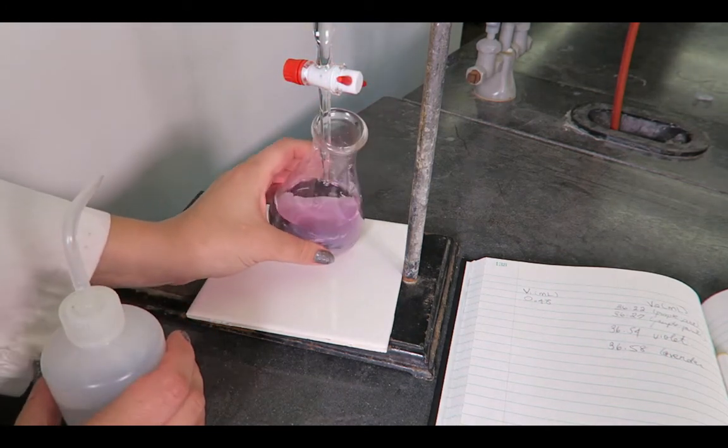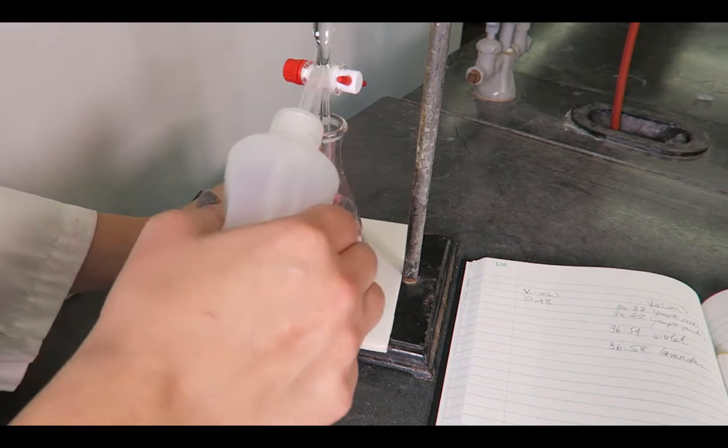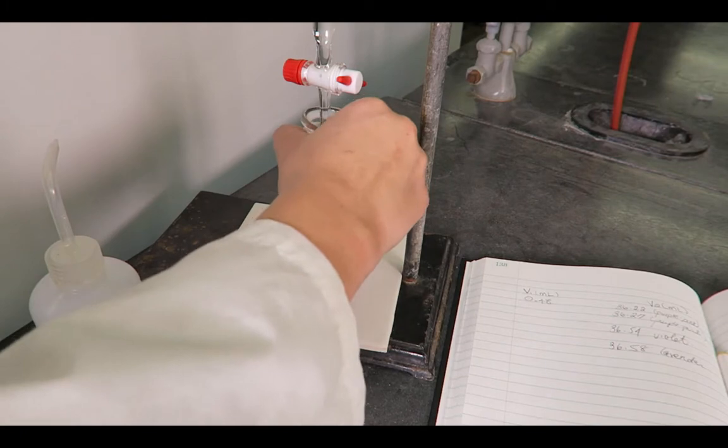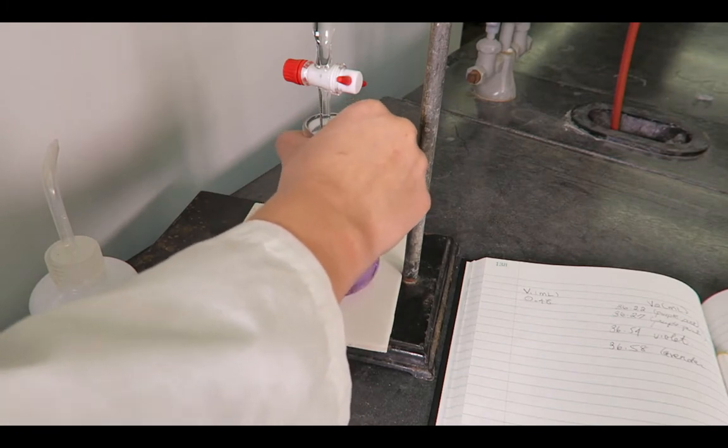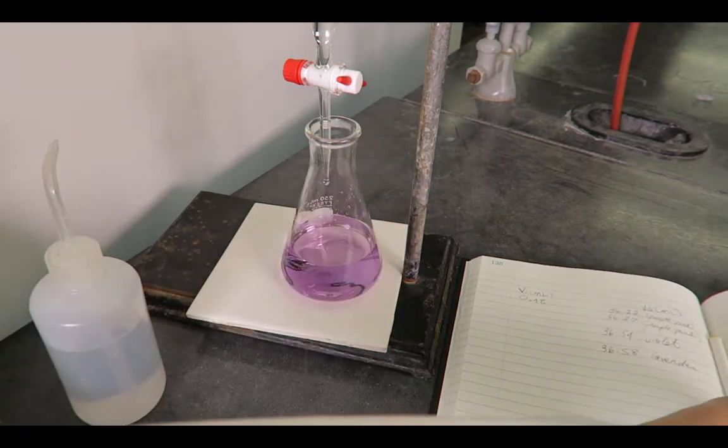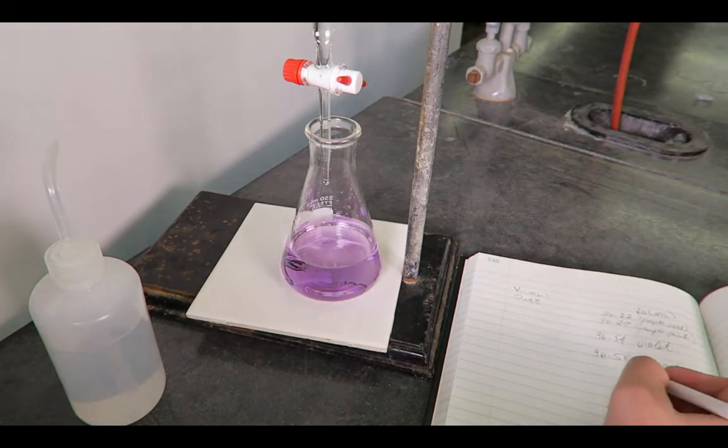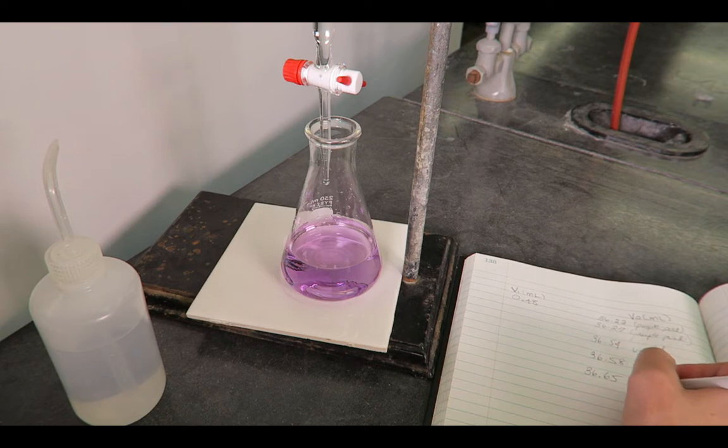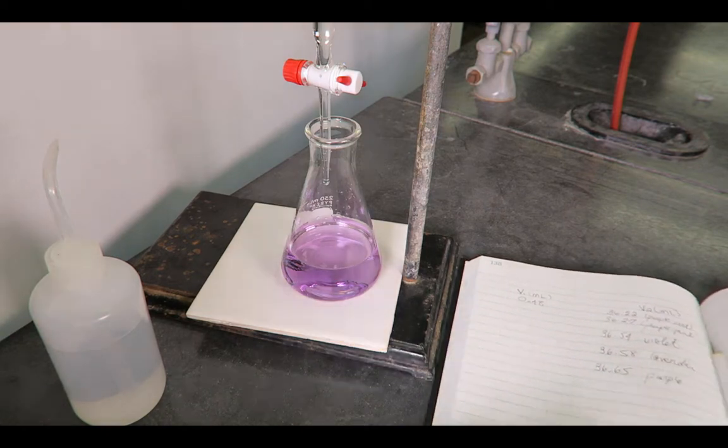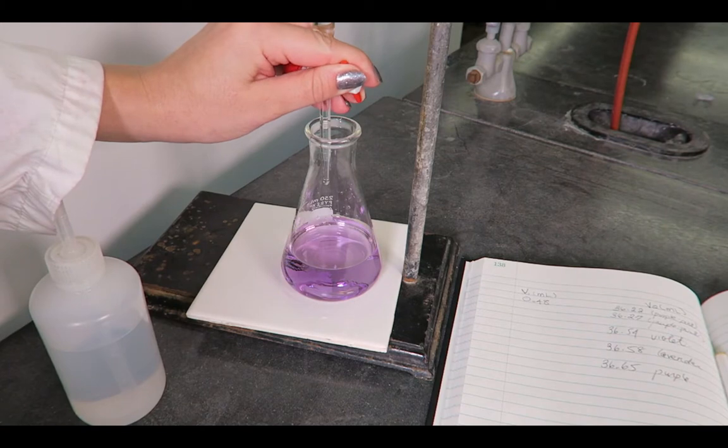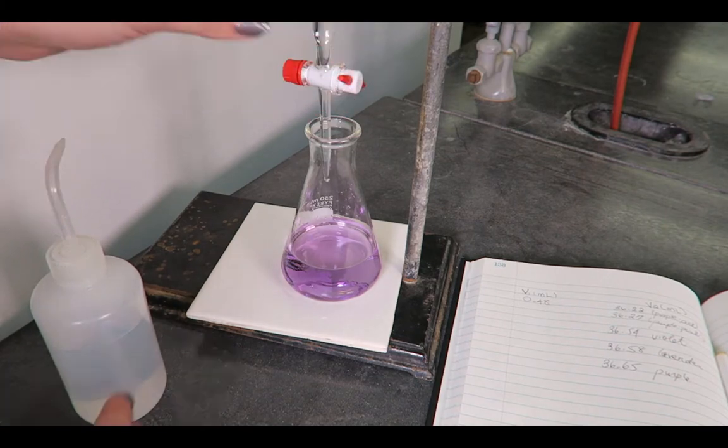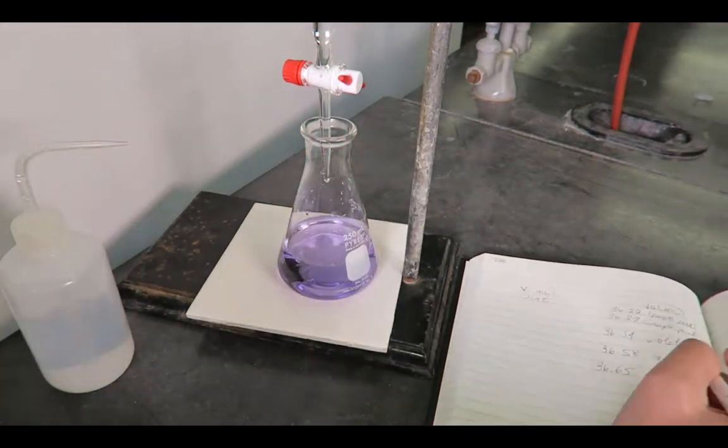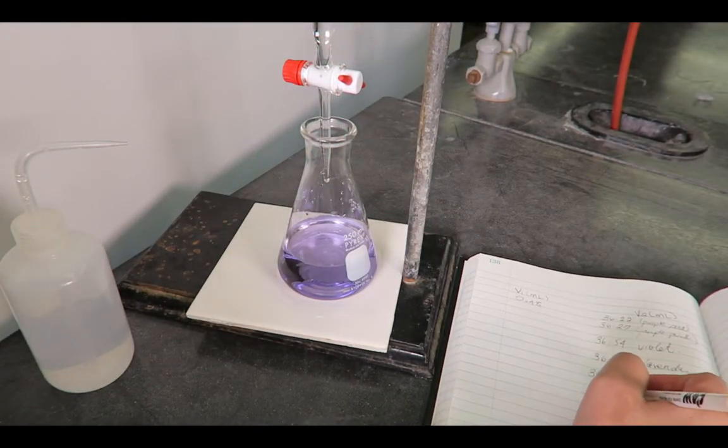Add titrant drop-wise, touch off the drop on the side of the flask, and rinse down the flask with deionized water. Read the burette and record the volume and color. Continue adding drops and recording the burette volume and indicator color in your laboratory notebook until the indicator color remains constant.